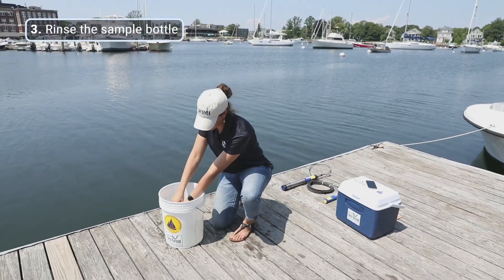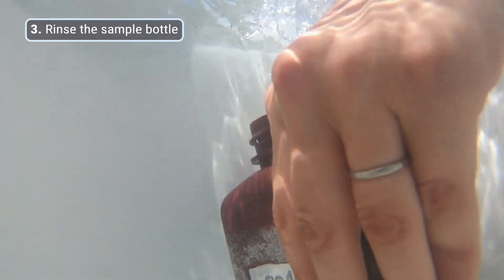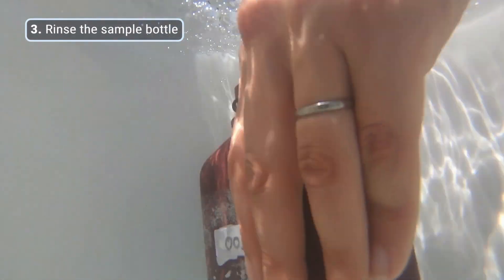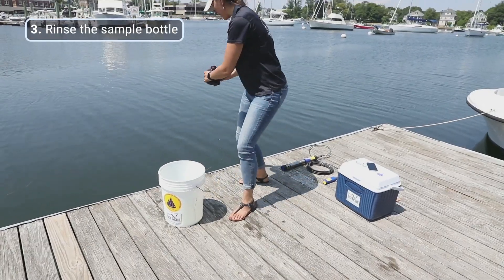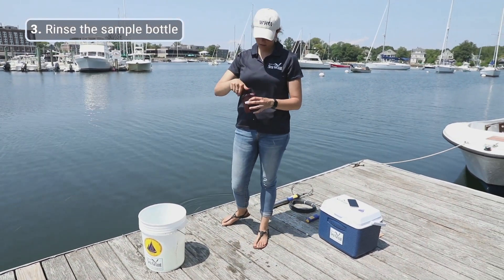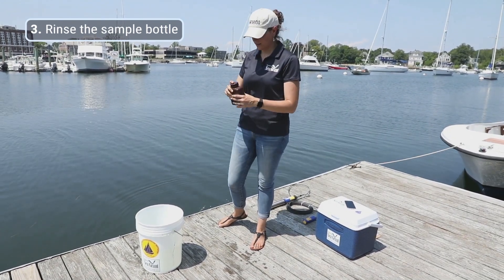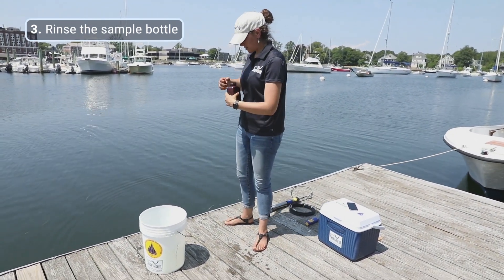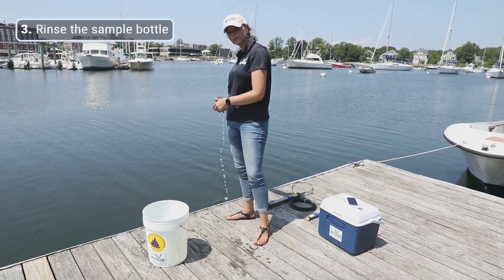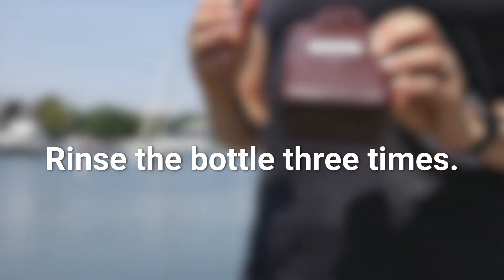We're going to put the bottle into the bucket with the lid on, open the lid under water, let the bottle fill, then dump out about half of that water, put the cap back on, and shake your bottle to rinse, then dump that rinse water out. We're going to repeat those rinses two more times for a total of three times.